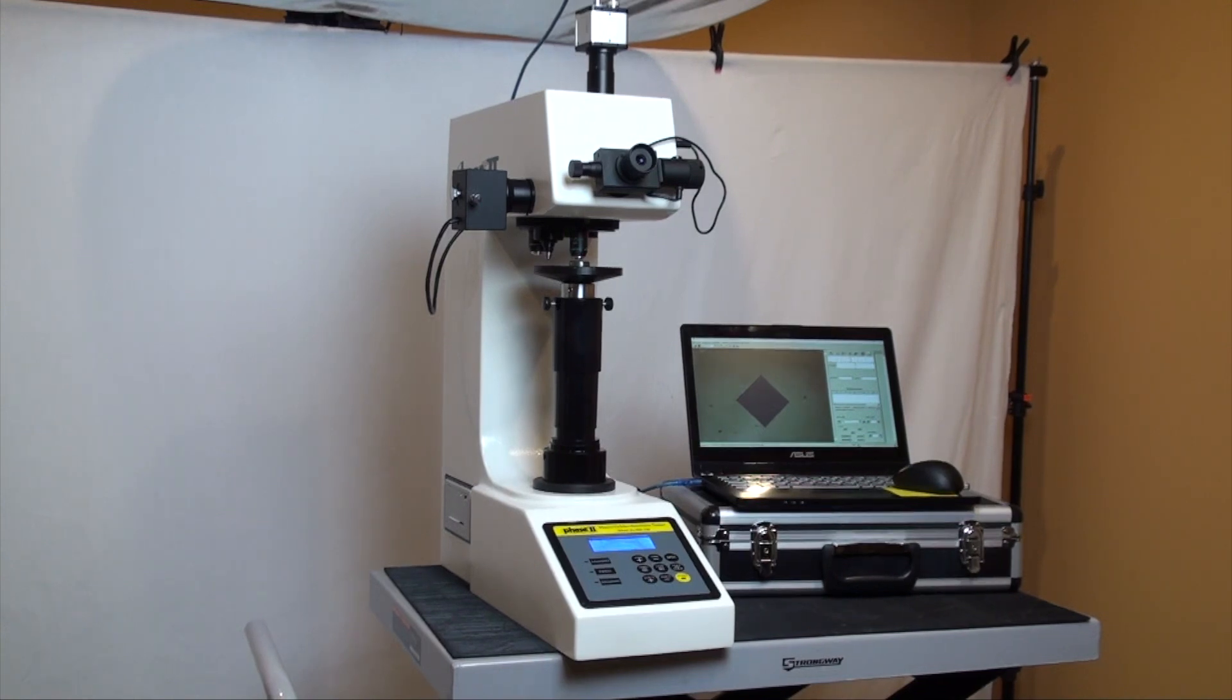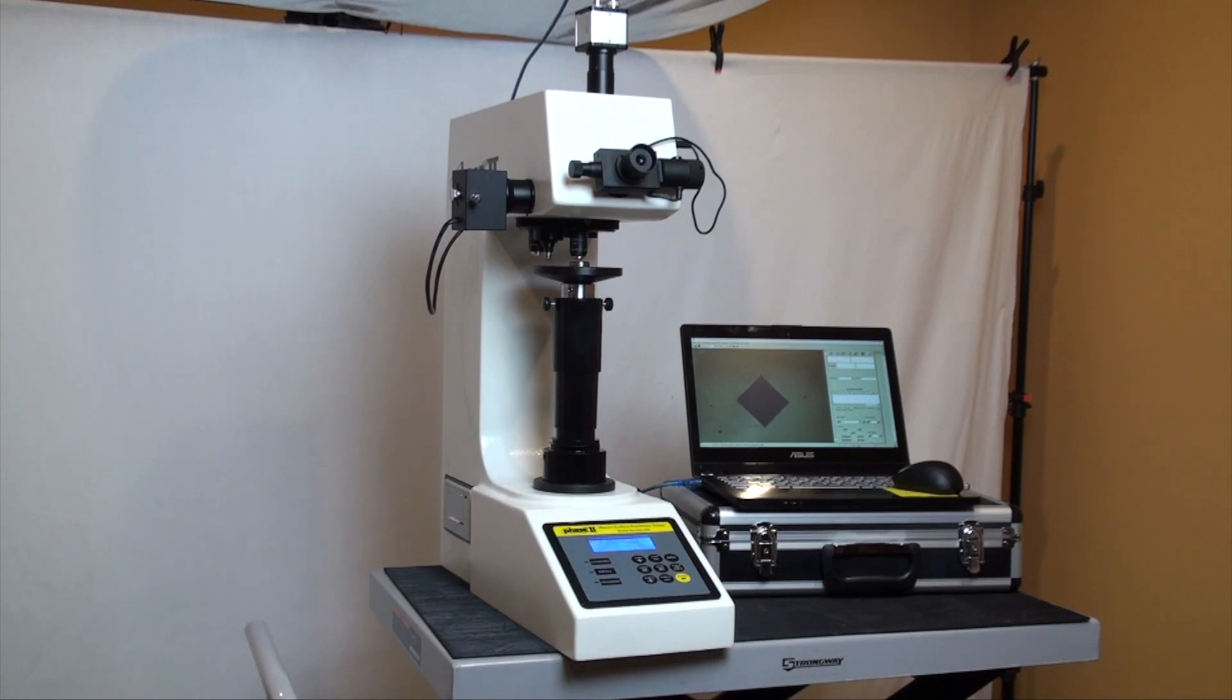Now let's move over to the operation of the hardness tester and see how easy it is to utilize the different functions, taking tests, and obtaining results.